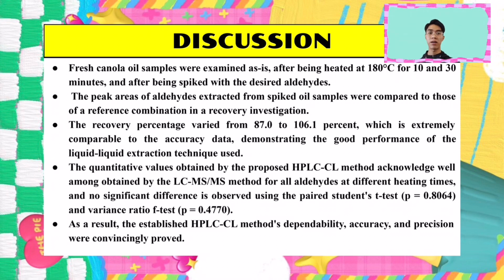These fatty acids might be oxidatively decomposed by heating and long-term storage at high temperatures, producing aldehydes with a disagreeable odor. Furthermore, some of the aldehydes generated are extremely hazardous to consumers. Therefore, examination of aldehydes in edible oil, whether fresh or heated, is essential for monitoring the quality and safety of these oils for human consumption.